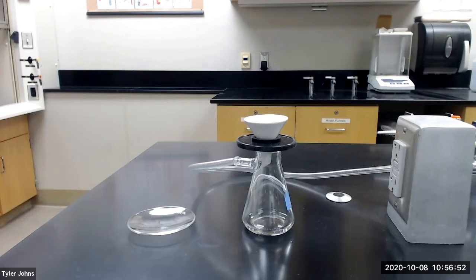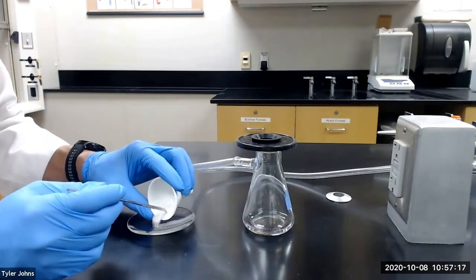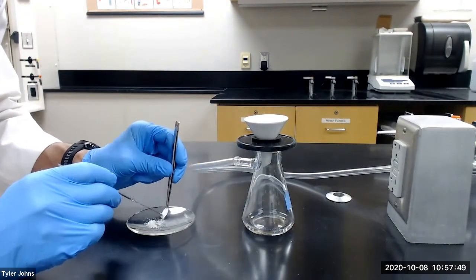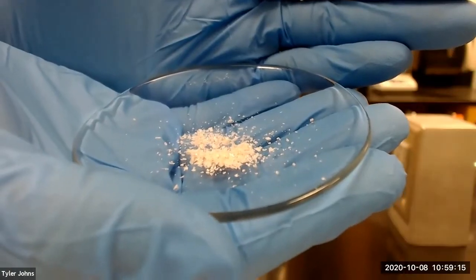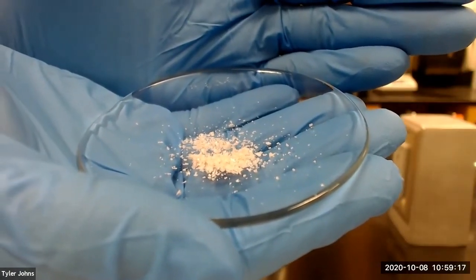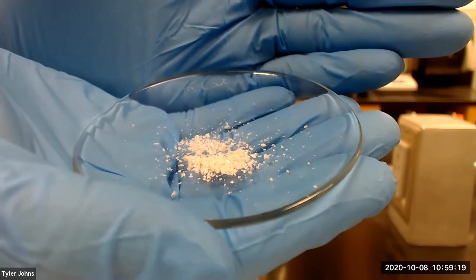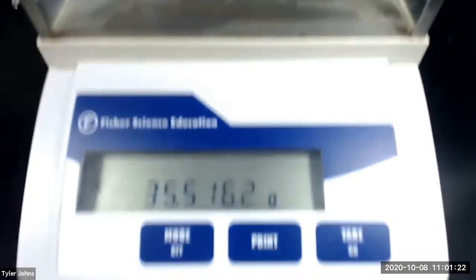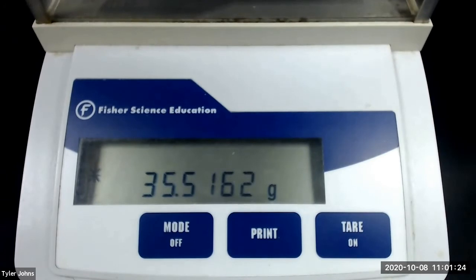We now need to collect our crude acetaminophen crystals on our pre-weighed watch glass. This is what our crude acetaminophen crystals look like. We next need to determine the mass of our crude product. The mass of our pre-weighed watch glass and our crude acetaminophen product is 35.5162 grams.